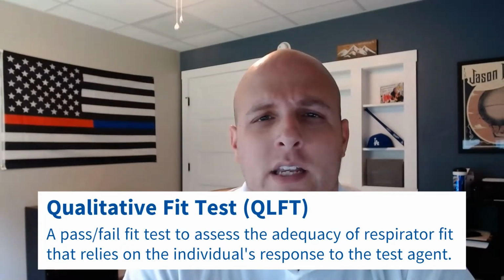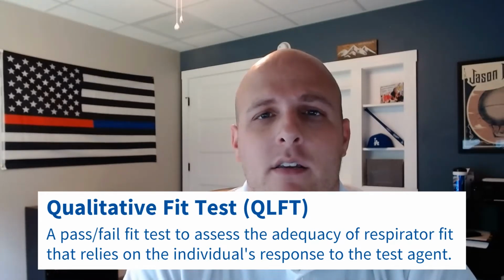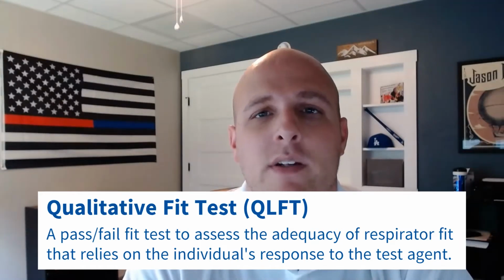And so we're talking about these qualitative and quantitative fit tests. So what are the differences? What are these two terms that are thrown around? A qualitative fit test is a fit test that is based on the user, the person wearing the respirator, based on their response to a test agent. And when I say test agent, we talked about a few of them earlier. You have your isoamyl acetate, you have your saccharin solution, you have your irritant smoke, your Bitrex, a few others. So their response is going to determine whether they pass or fail.